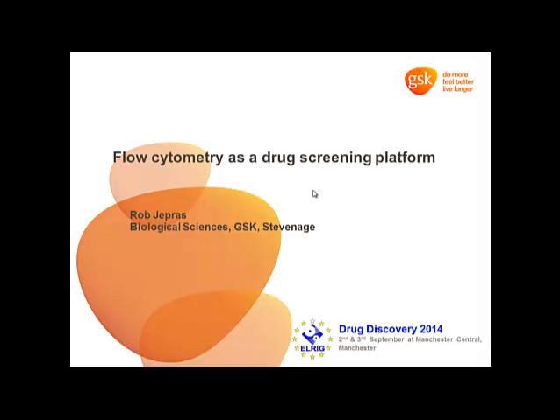If we're talking about hype cycles, I reckon flow cytometry probably started its first hype cycle around 1970, in the early 1970s, and probably came out of it in the early 80s, which would have coincided with the HIV epidemic. And even today, by far the biggest application of flow cytometry is in clinical labs, particularly for general immunology. And still, by far, the biggest use is for CD4 counting in HIV patients.